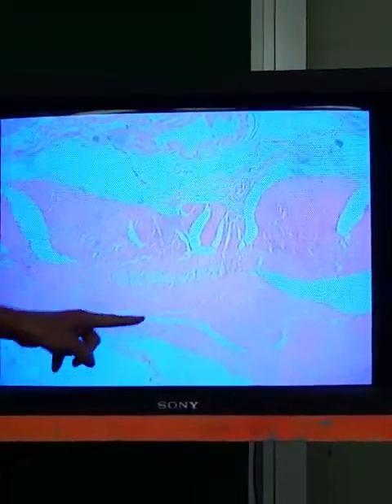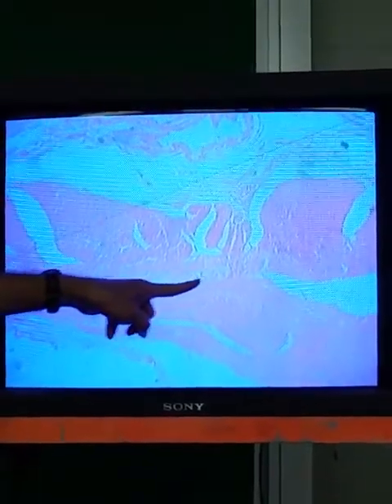There's the rest of our submucosa. Here's our muscularis, circular layer, longitudinal layer, Auerbach's plexus in between. And right there is our serosa. I pulled away that little bit of our serosa. Here's our serosa. Let's see here. Will we be able to see a lacteal in any of these? We'll see those on our model. Model only.